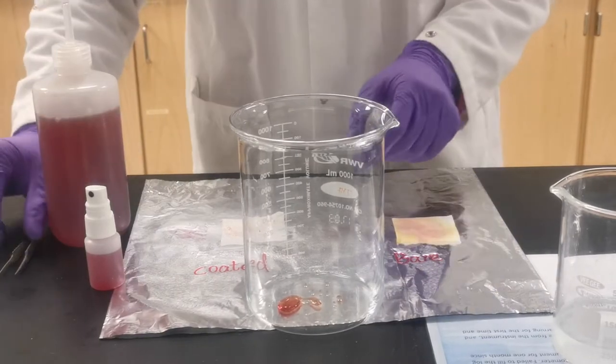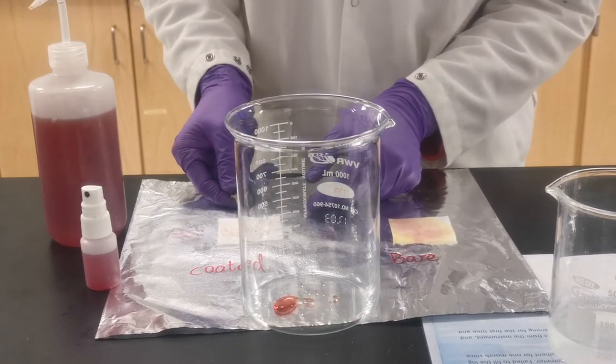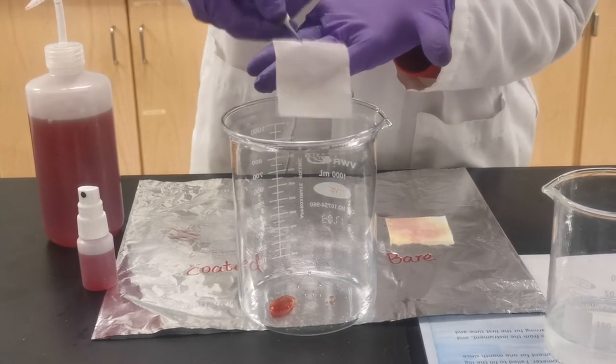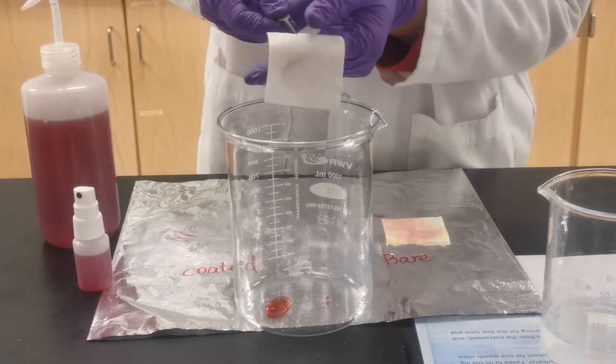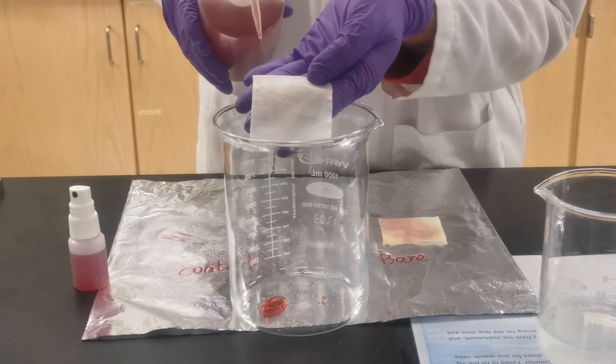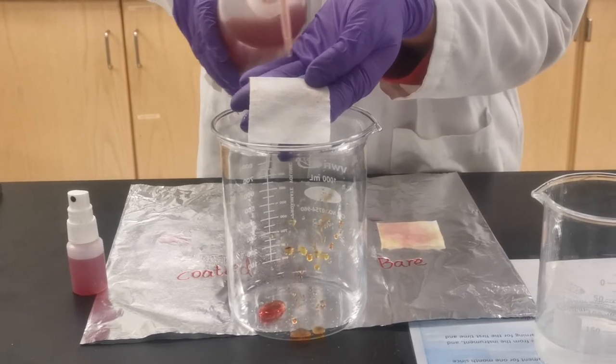However, if we take out our coated piece and just shake it, you can see the droplets come out. Also, when we use the wash bottle on the coated fiber, it is fully prevented.